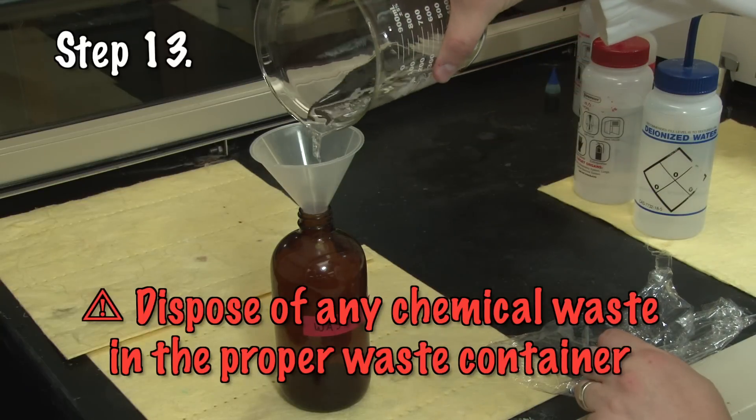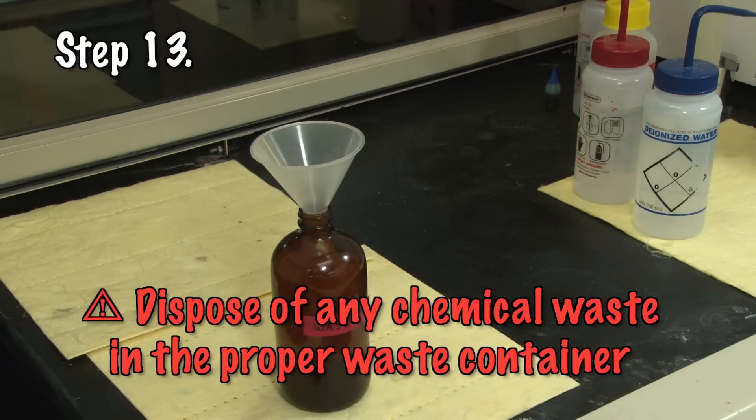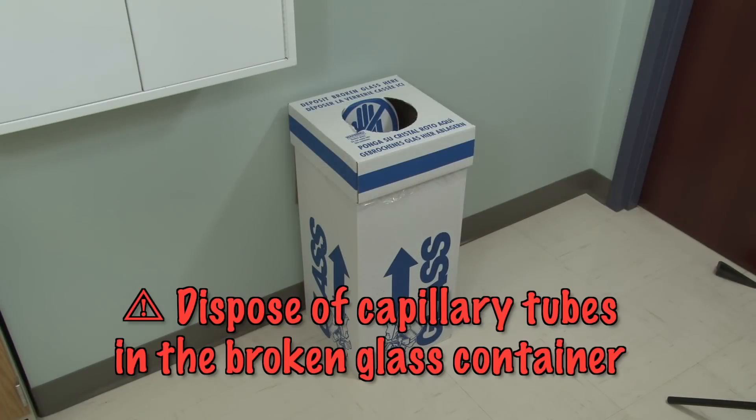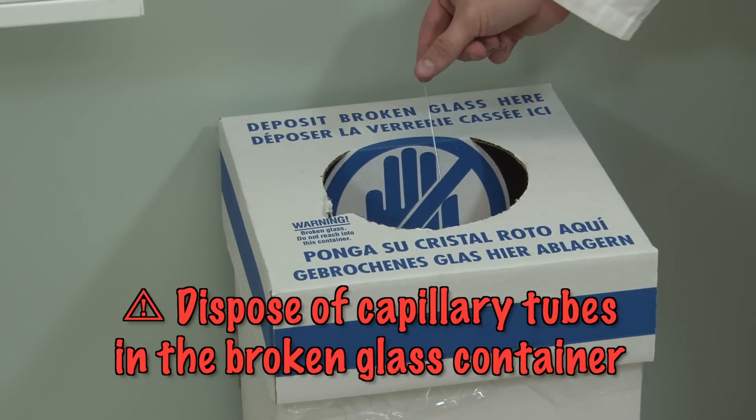Once all the groups are finished with the known chemicals, you can dispose of all your chemicals into a waste container. Capillary tubes need to go into the designated broken glass container.